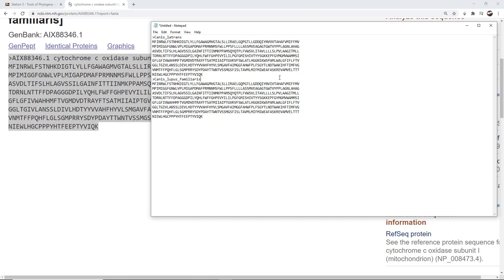So that is GenBank — that's how you would go in and find information. You have to know some information going into it, but in the end this is how you would extract that information, download it, and get it ready for analysis. In this case we're going to be looking at some analysis of different canids — I'm going to add a wolf and probably a few other things. The next few videos for the lab will show how to use ClustalW.